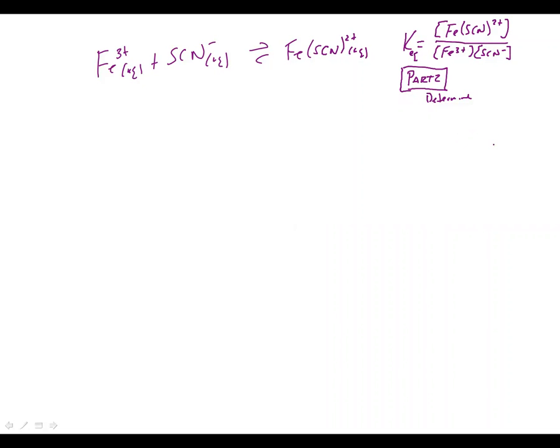And you're going to do it at 2 different temperatures, so kind of a cold temperature and a hot temperature.